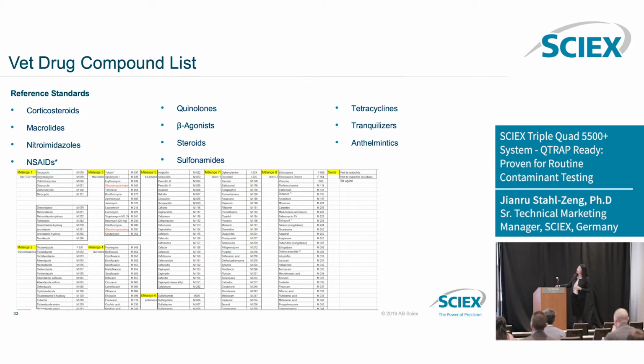So we made the choice of antibiotics, because if you are doing antibiotics analysis, you know you have different classes, and they have different regulations. For some of them, it's forbidden. That means you need to run down to a very low level. And some of them are allowed, but they have some regulations. So when you want to run them in one injection, your instrument should have some kind of linearity, able to let you run the entire panel, the entire picture here.